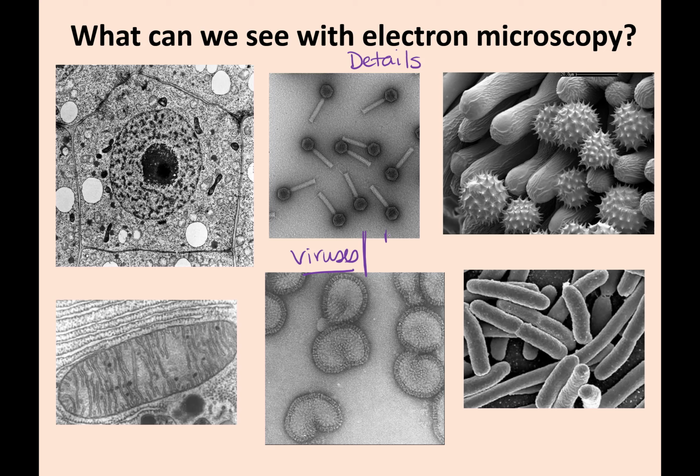If you want to know, this is a phage. This is a type of virus that infects bacteria. And this little guy is influenza, the virus that causes the flu. Okay, so that's one big difference. You can see much greater magnification, and you can see much greater details.